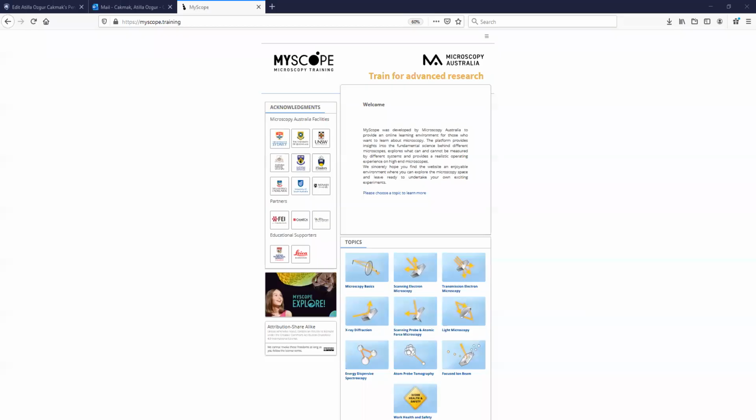All right. So the last item I'd like to talk about, and that you can also bring to your classrooms for your students, for better understanding and exposure, is this wonderful website, Myscope, that gives you a chance to be more familiar with many of these nanocharacterization tools. We'll go over some of them listed here. The first one is a scanning electron microscope.